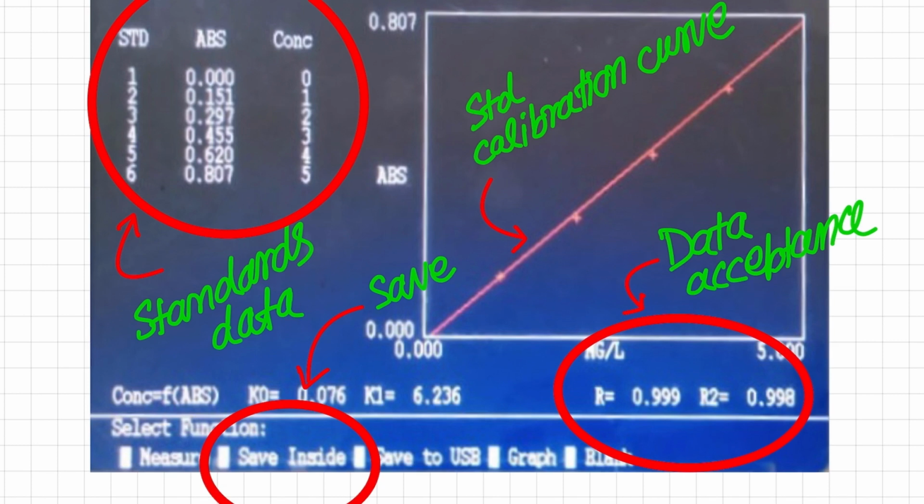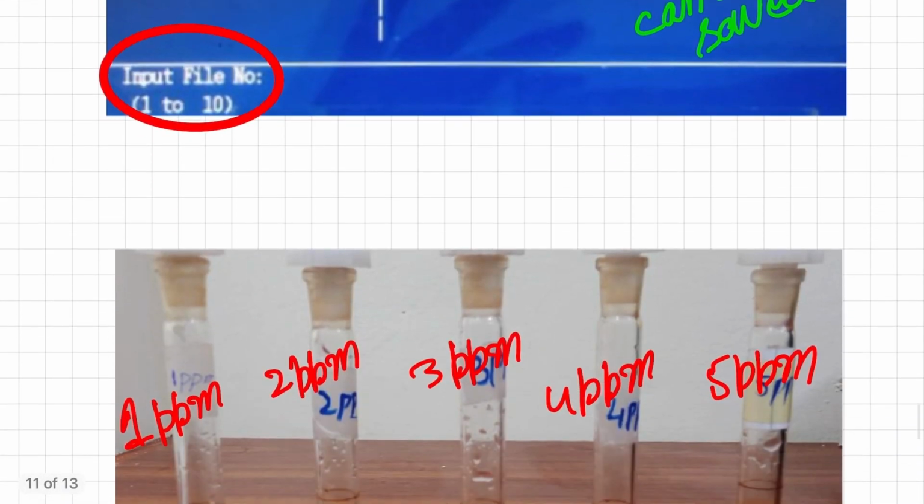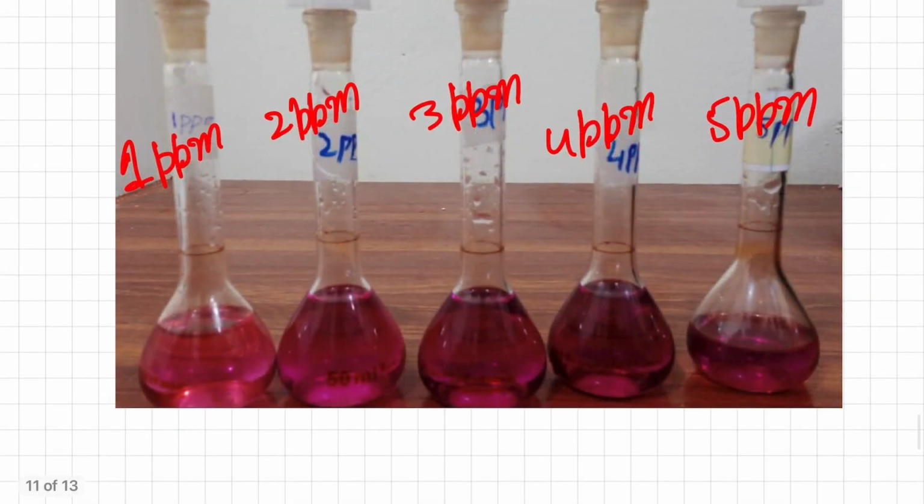So the preparation of standards is the key in this whole experiment. Now there is a question that, for example, you have prepared the maximum concentration of the standard solution, which is 5 ppm, and in case your unknown concentration is greater than that concentration, then what will you do? For example, if your solution is colored, then you will see that your unknown concentration solution is darker than this solution. So what will you do?